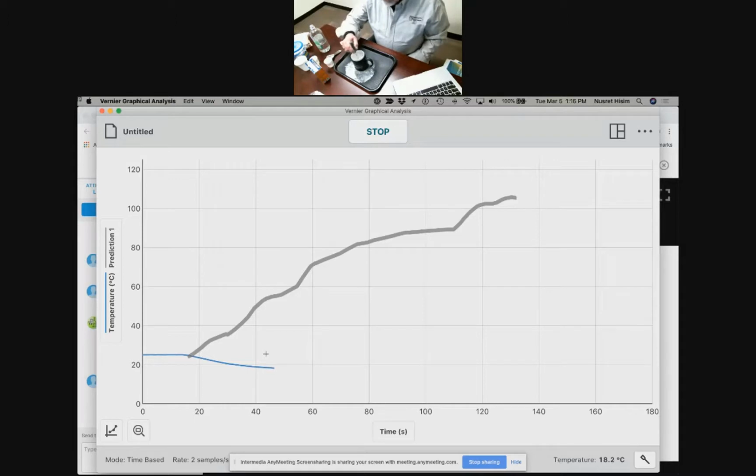For most people that have never actually measured it, they usually find this a little bit counterintuitive. You know, it's like, wait a minute, bubbling and fizzing, shouldn't that be getting hot? Well, I tell my students, that doesn't really work here, because we're measuring this and it's not getting hot. If anything, it's getting colder. You can see in the bottom corner here there is a temperature of 17 degrees, and you might remember it was in the 20s when we started.